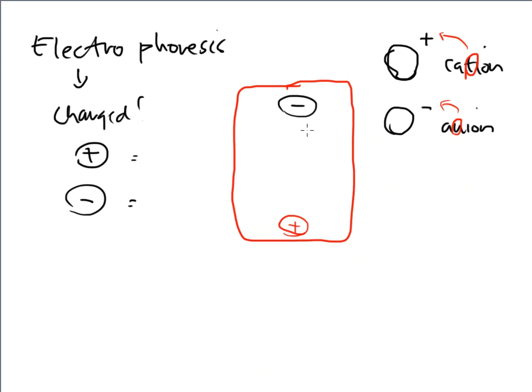So what happens is that, let's say that I have a sample. There's my sample, all right? And let's say that my sample carries a negative charge. So rules of magnetism, opposite charges attract. All right, so we get the sample.